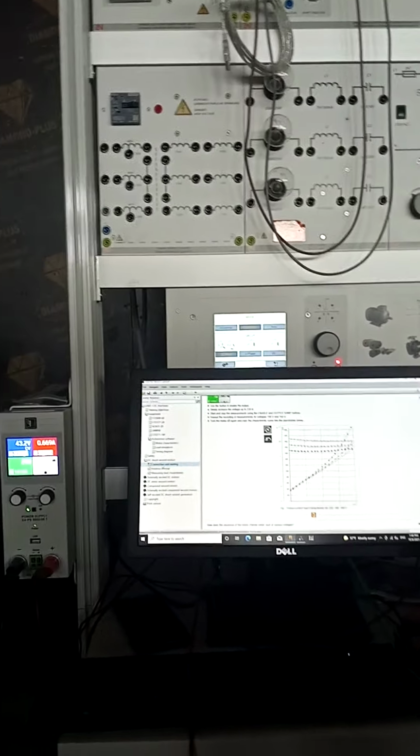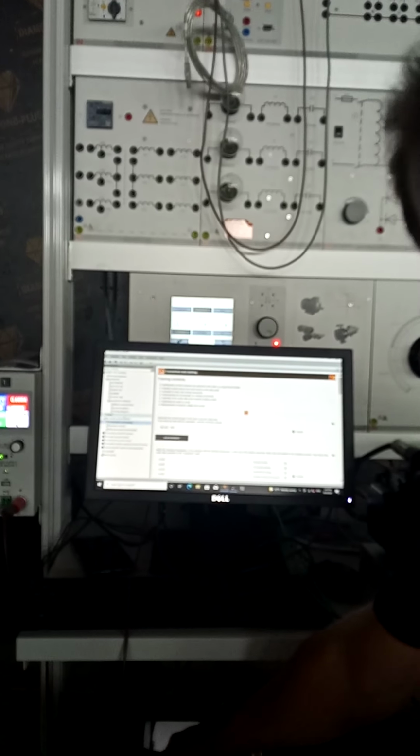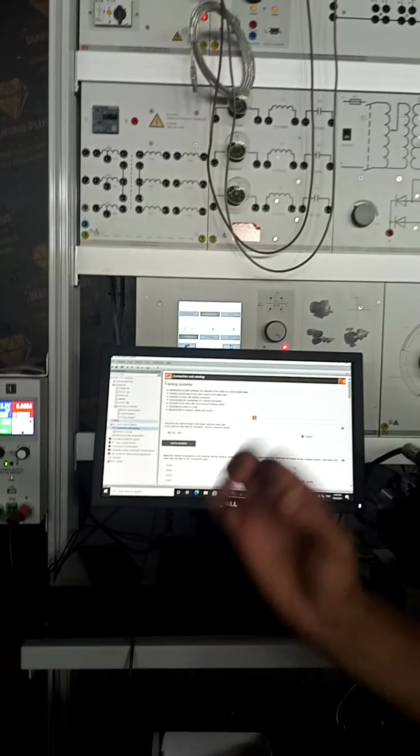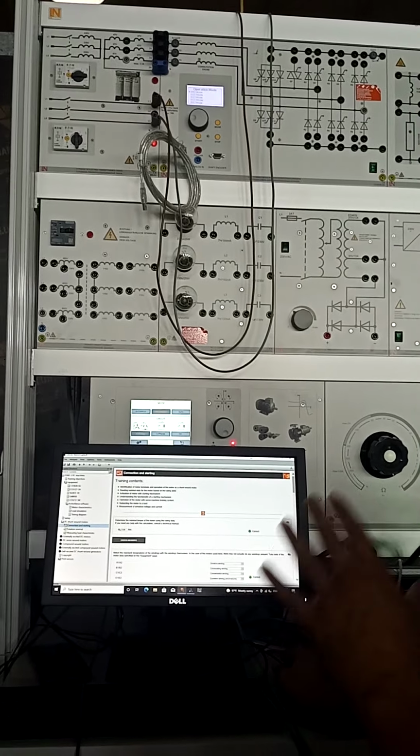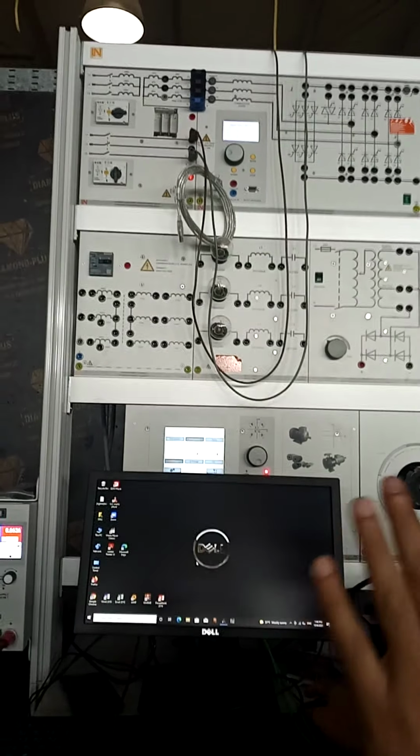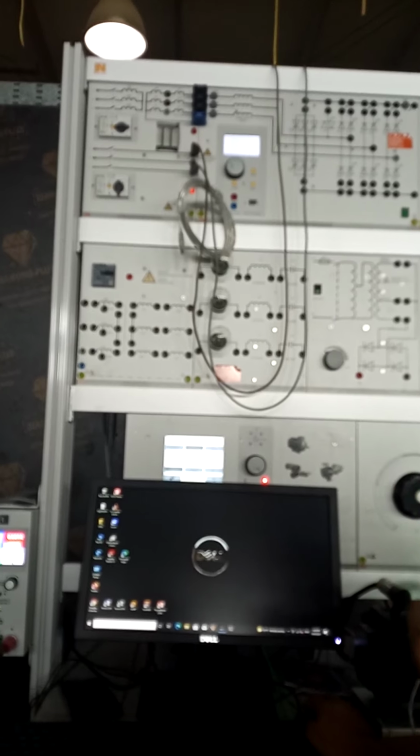I can show it here, but the student cannot see that. You don't give the student this answer. It's not in the PC, it's not installed. It is only in this USB. And answers are very important for the teacher. It's only in this account.